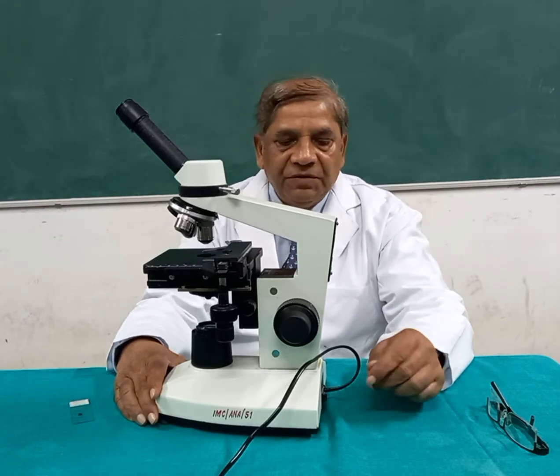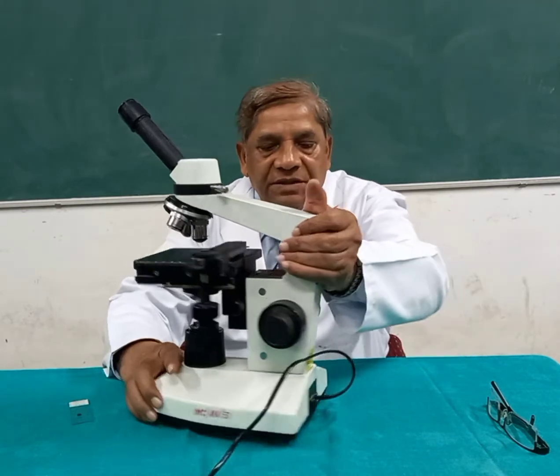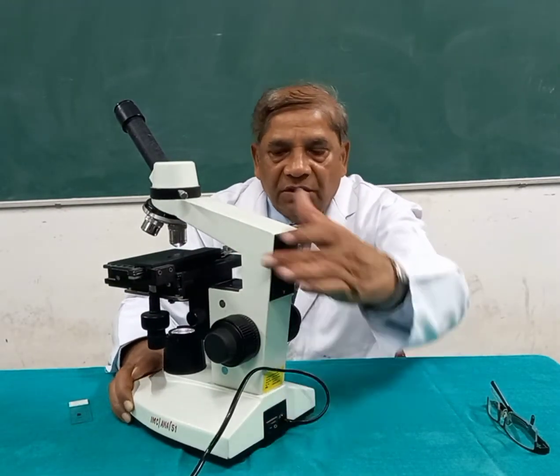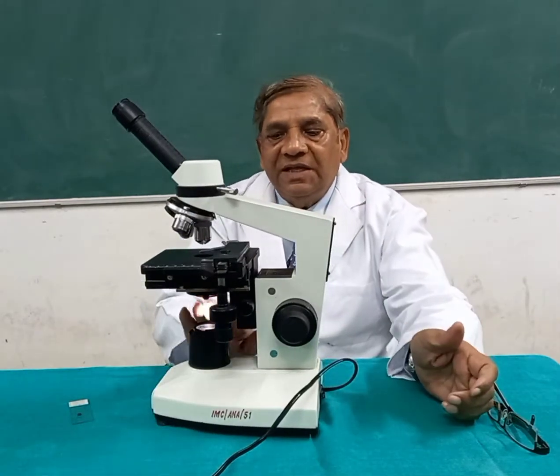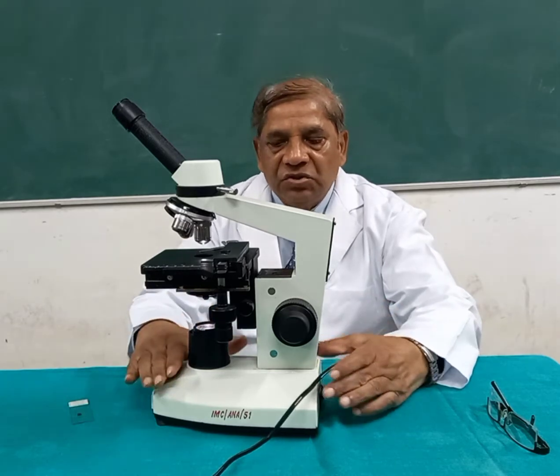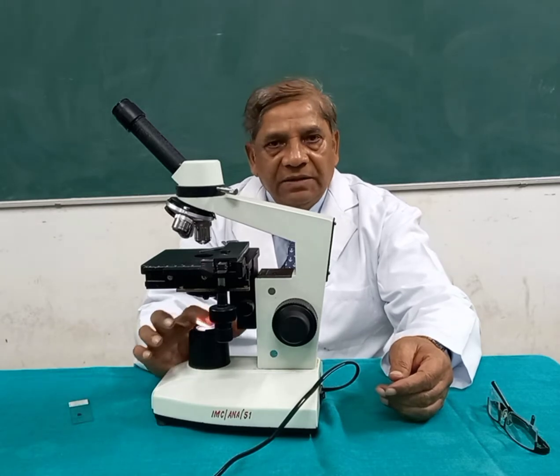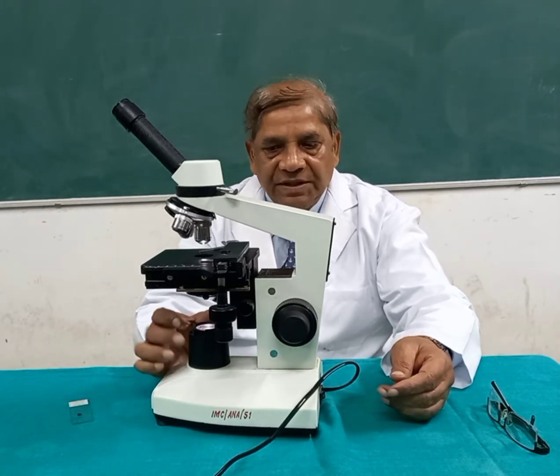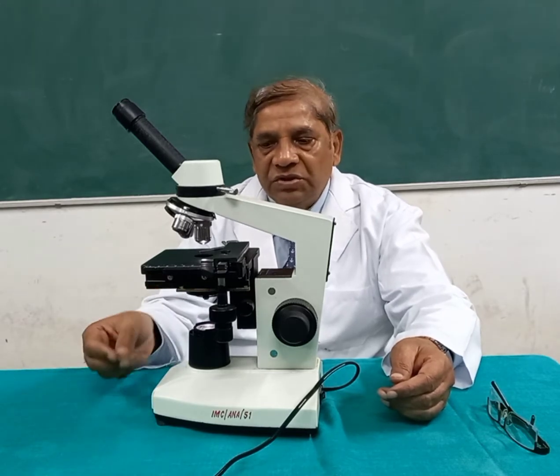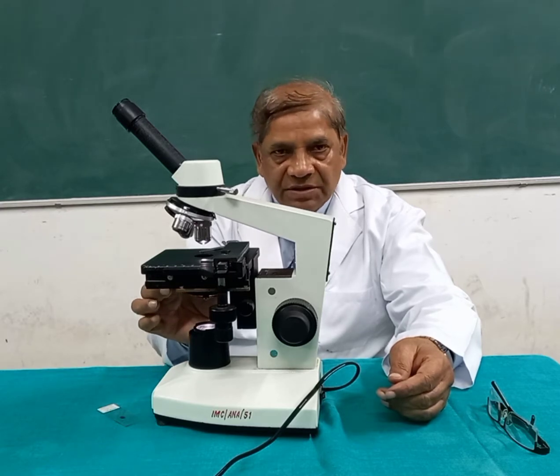The first step in focusing a slide is that you just put on the light. There is a switch on the back of this microscope where you just turn it on, and then you will see that light has started coming from the source of the light. This is the source of the light, on the base of the microscope, where the electric bulb is fitted. The light is passing through the condenser and the diaphragm.